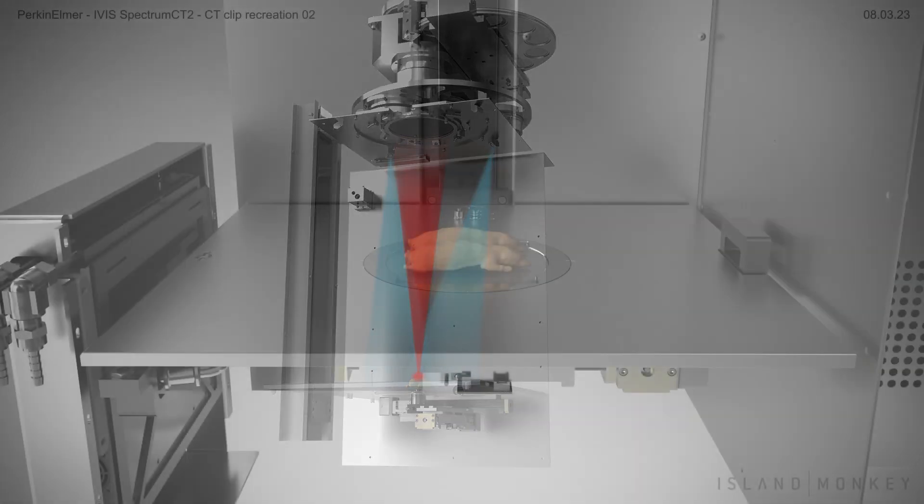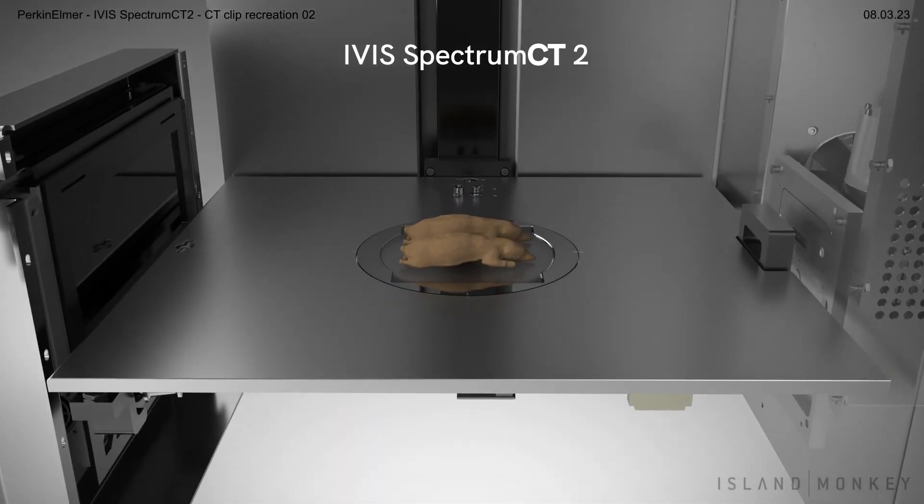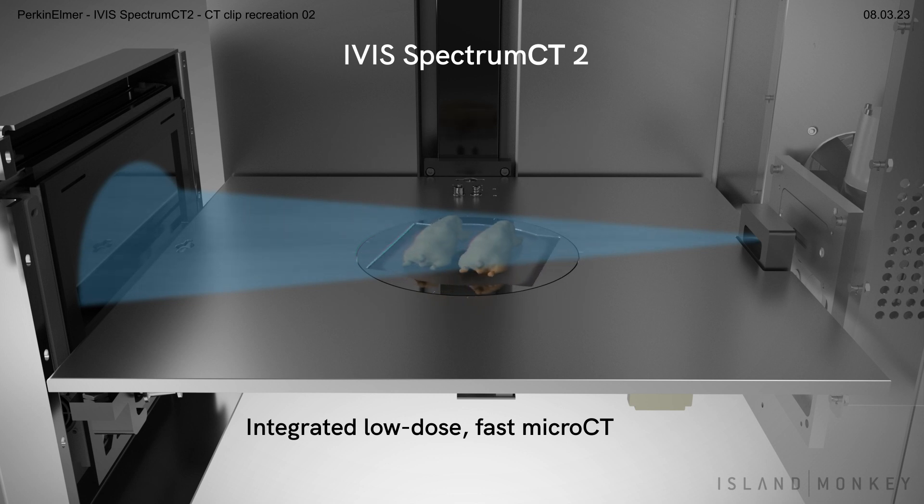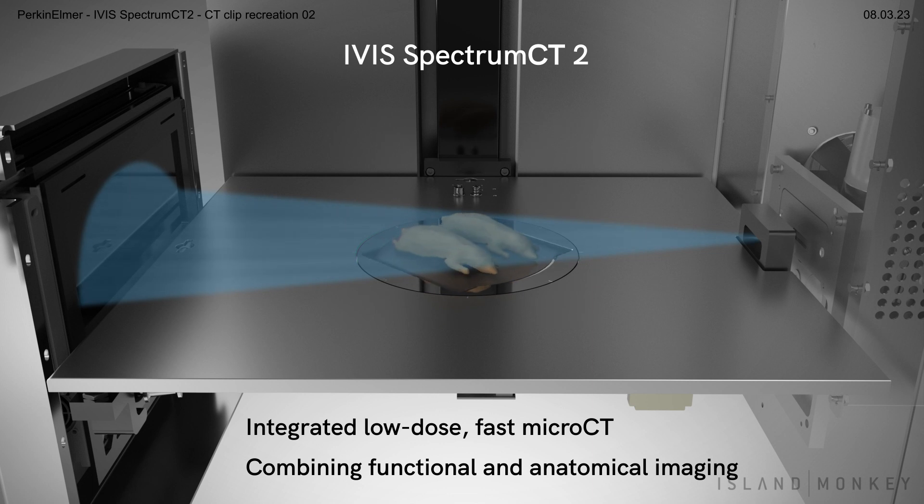For ultimate ease and flexibility, the IVIS Spectrum CT2 system incorporates integrated low-dose CT, combining both functional and anatomical imaging into a single system.